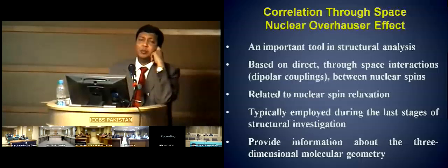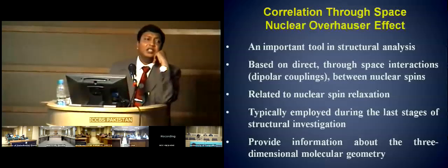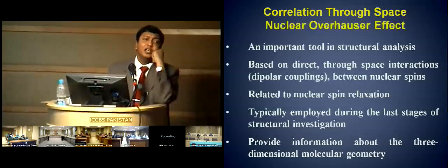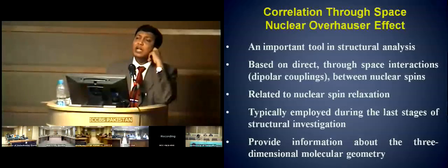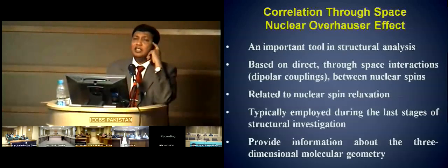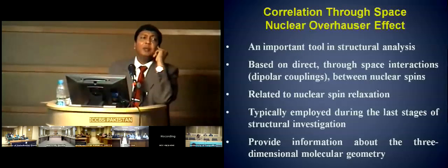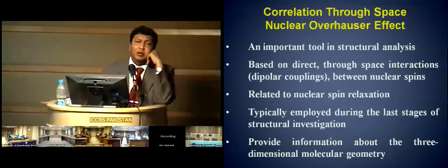And then we learned that when we do polarization transfer, we see the other proton from which the polarization is transferred, detected through the nuclei which is detected through. So it is indirect detection. Then we learned that this tremendous sensitivity increase will really make your carbon-13 NMR spectroscopy a practical process.